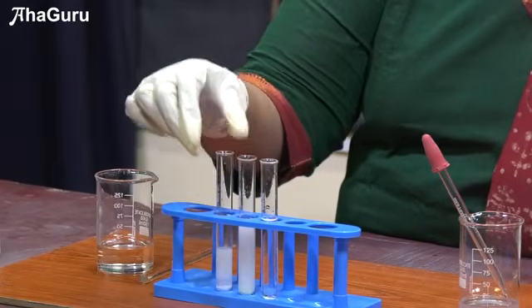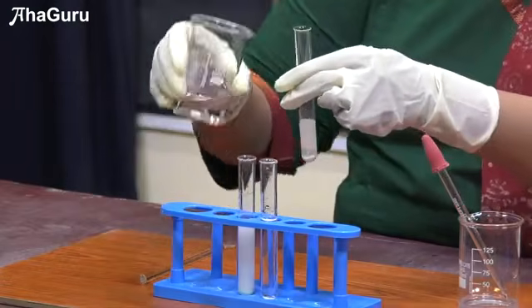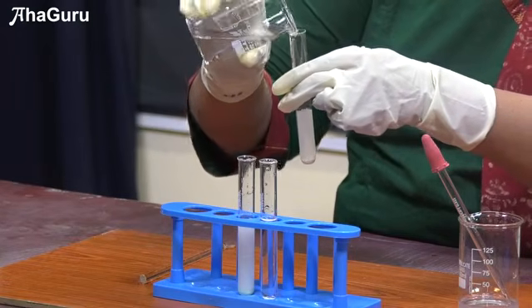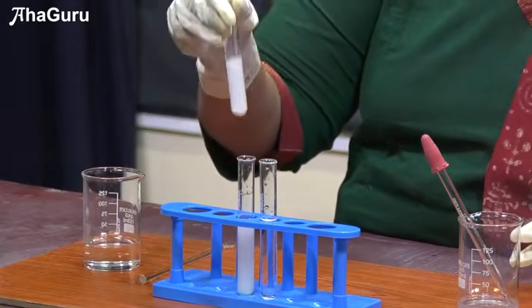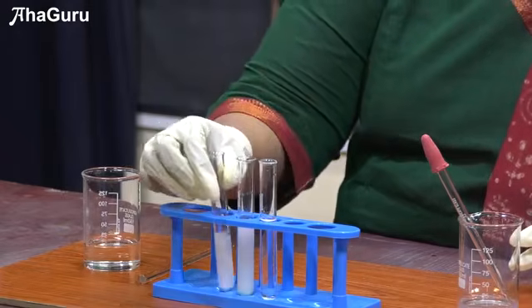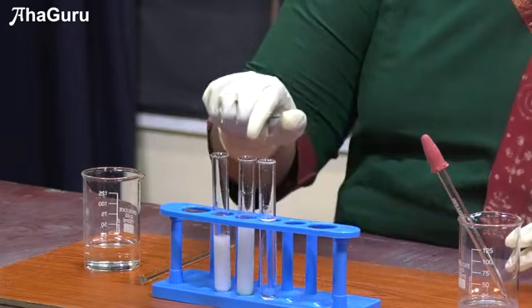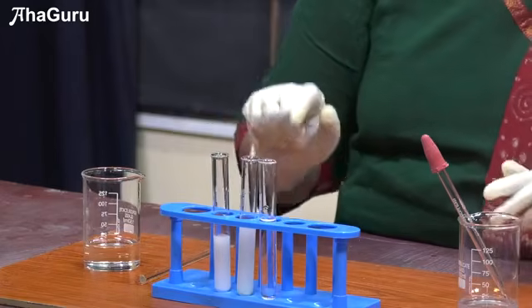Now let me add to the iodide solution, that is AgI precipitate. You can see this will be completely insoluble in ammonium hydroxide. So chloride is soluble in ammonium hydroxide, bromide is sparingly soluble, and iodide is completely insoluble.